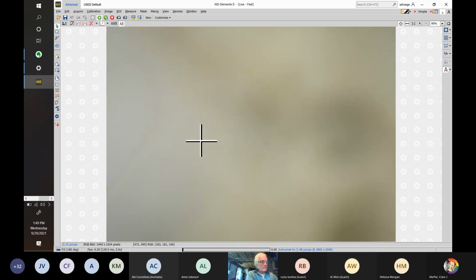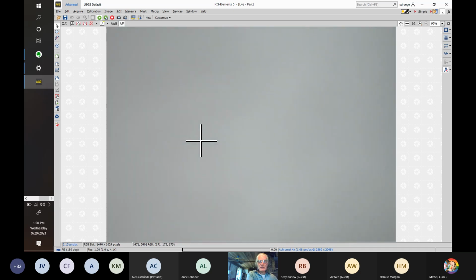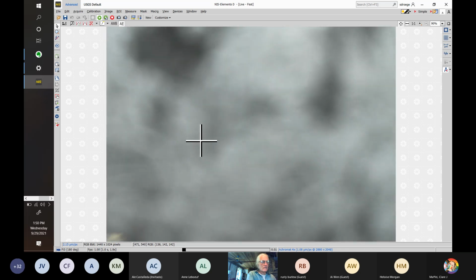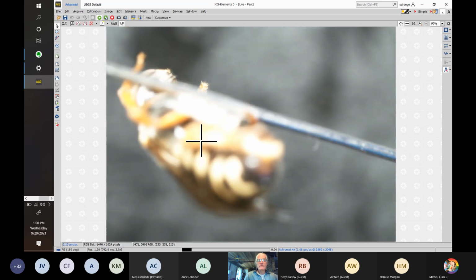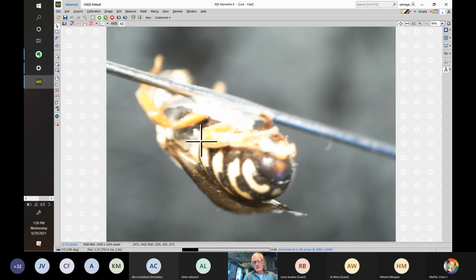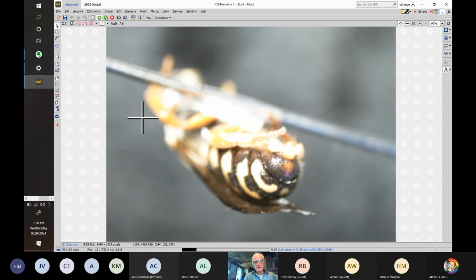So here is the male Dianthidium concinum, and just to point out here that the rear end is often, I think we're losing, our internet speed seems to be slow. So at the species level, a lot of ID for the males hinges on what's going on back here. Let's see if I can change that light a little bit, maybe not. And white balance. So I'll zoom in a little bit more, maybe that'll make a difference.